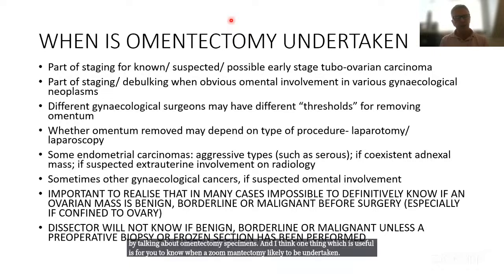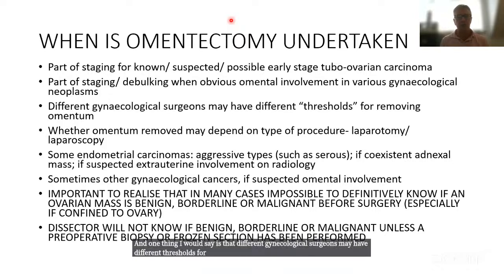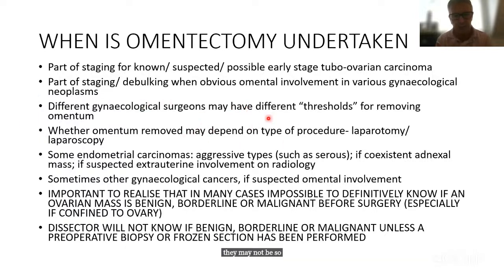One thing I would say is that different gynecological surgeons may have different thresholds for performing an omentectomy. For example, a gynecological cancer surgeon may remove the omentum quite a lot, whereas a gynecologist who mainly deals in benign diseases may not actually remove the omentum.